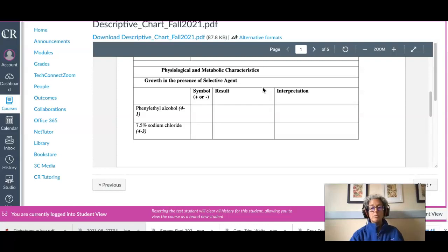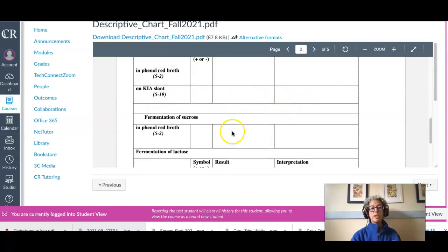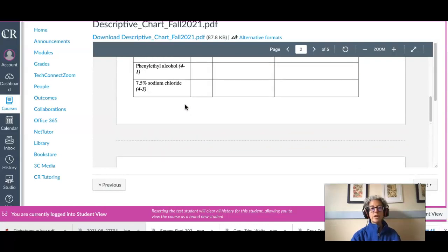And that's really the way that we can distinguish our bacteria. We can't just do it by shape. Millions of different organisms might have the same shape. That's not going to be nearly enough. The gram reaction helps. It cuts our possibilities in half, but that's still just one physical characteristic. We have to look at the entirety of their metabolism and the different types of capacity, and that's how we can separate them out. And so we have a way to record the information for all of the tests.